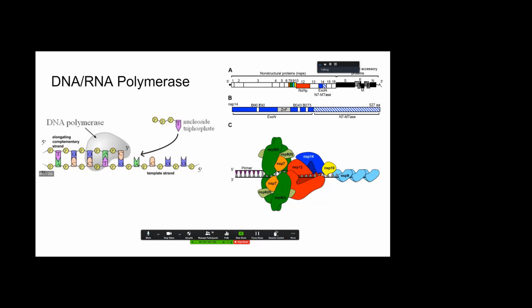So the DNA polymerase in humans copies your DNA, allows your cells to divide, allows you as children to grow. The test that I'm going to be discussing today is called a polymerase chain reaction. So if you understand, polymerase is just this enzyme that chugs along, making the chain, making the chain, making the chain.